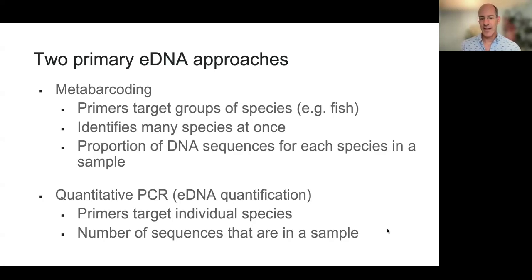And if you set a threshold for a certain level of DNA, like whenever you have 10,000 copies of DNA in your sample as it goes through this whole series of reactions, for samples that start with a lot of DNA, they might cross that threshold after only a couple of cycles of this chemical reaction. So you have a lot of DNA. But if you have to double the DNA with reactions a whole bunch of times before you get to 10,000 copies, then you know that you have very little of that species' DNA in your sample.